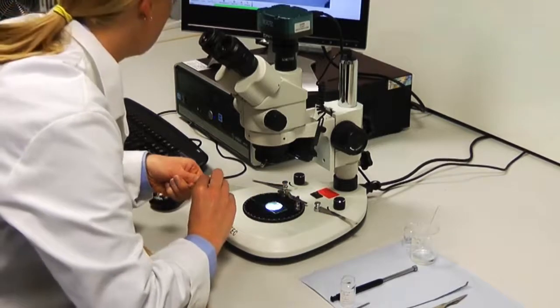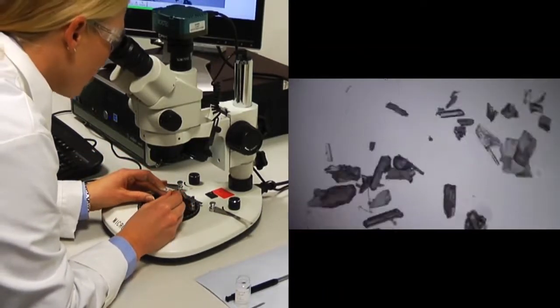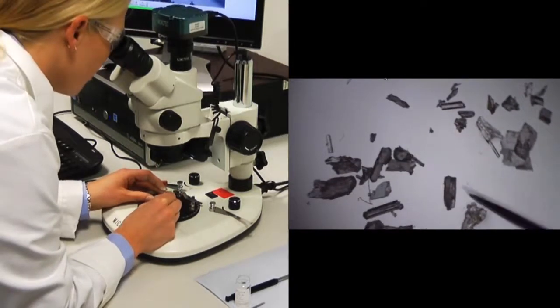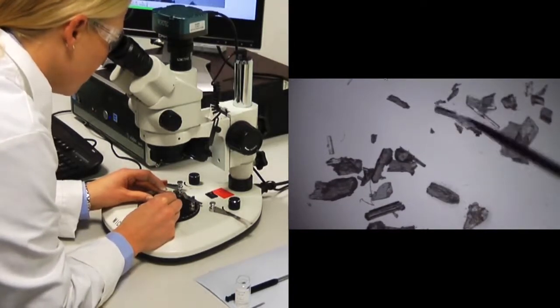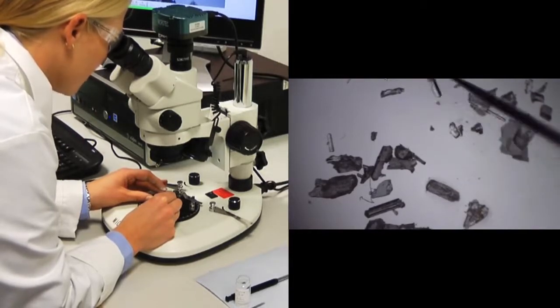Selecting a crystal can take some time, as not all crystals diffract as well as others. The best crystals are around 0.4 millimeters in diameter with regular faces. Under a polarizing microscope, good crystals will extinguish light when turned by 90 degrees.